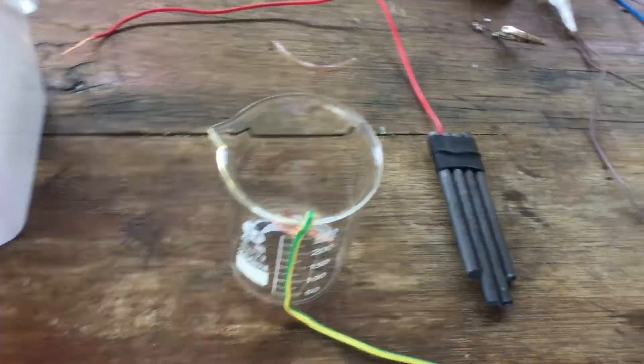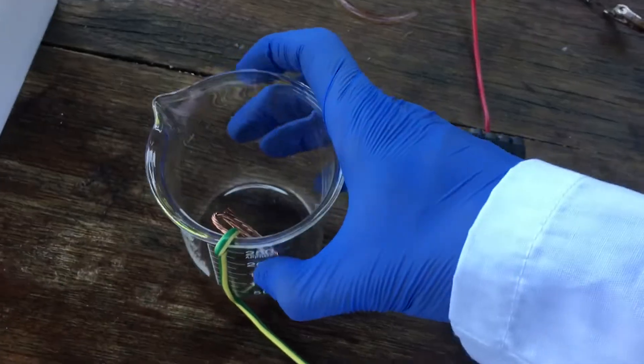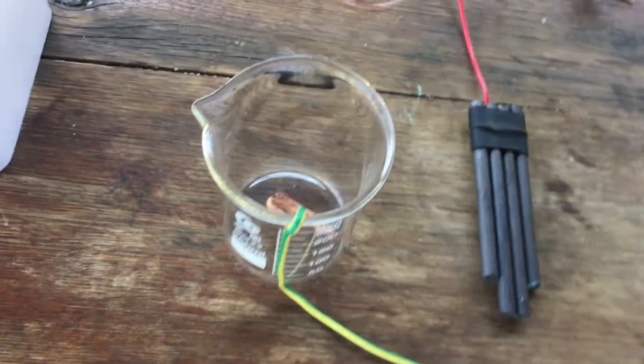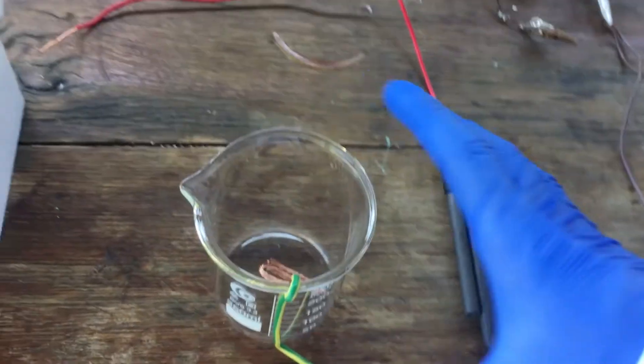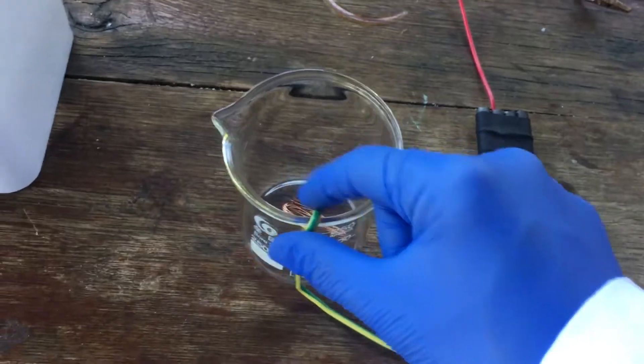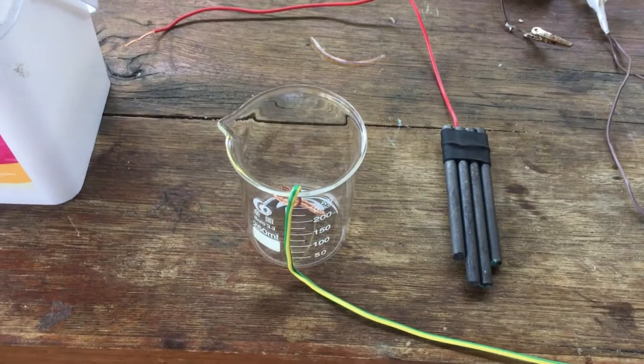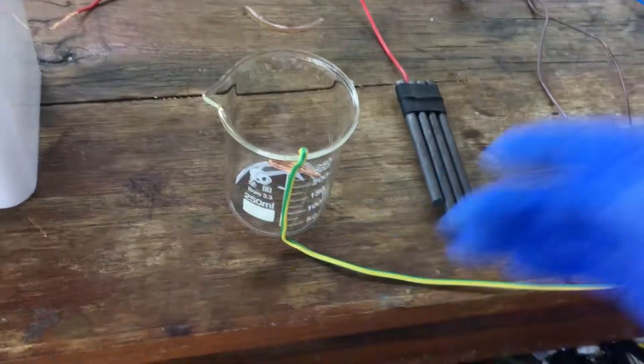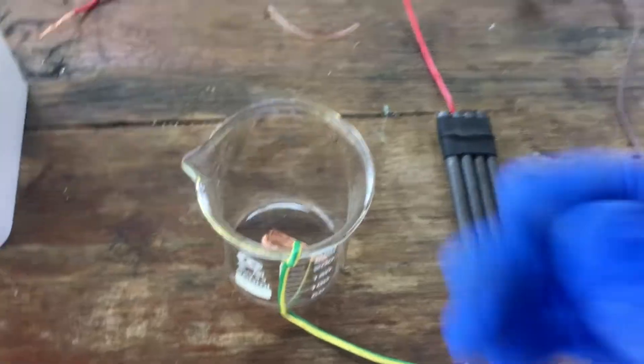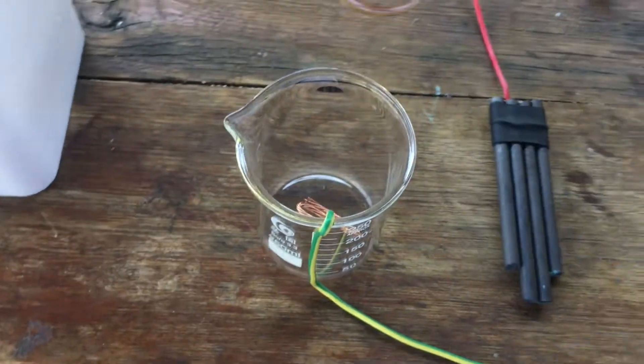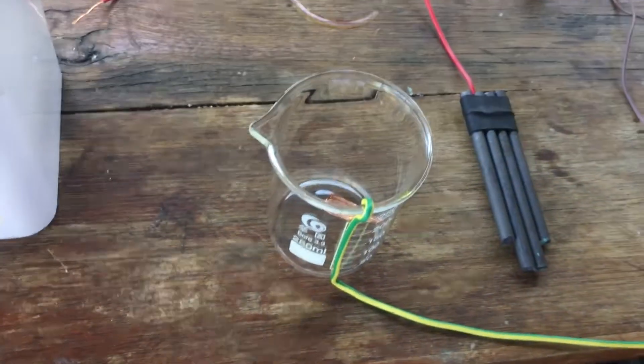The next thing we need is the actual electrolysis cell. I'm just going to be using a glass beaker, 250 milliliters. And then we also need our electrodes. Now, the cathode, that's nice and easy. Copper wire is definitely the best cathode you can have for this. It shouldn't corrode or anything in the conditions of the cell.